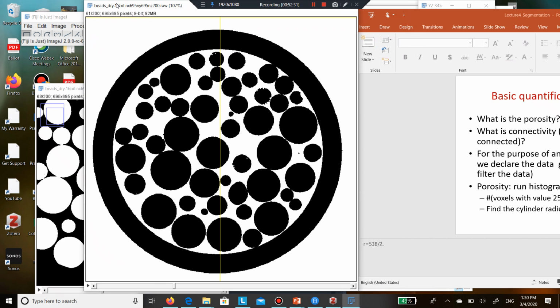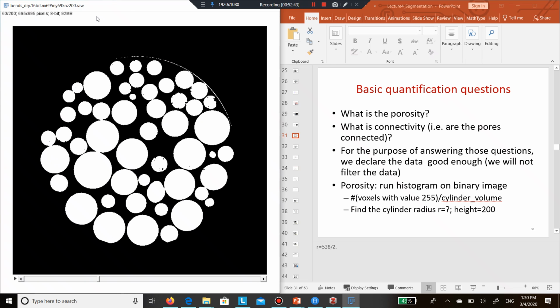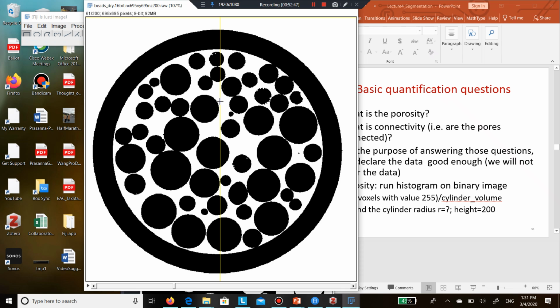Histogram. Now, if I do this histogram on my image, I don't have that oval. Remember that that can be a problem, because all the histogram does is count black and white. If I put an oval around it and ignore the outside, or for the heck of it, I'm just going to do rectangular.